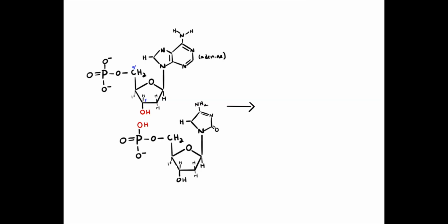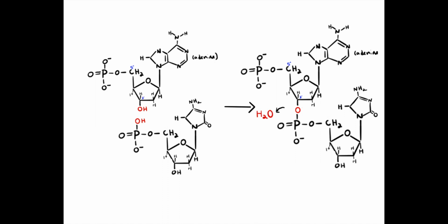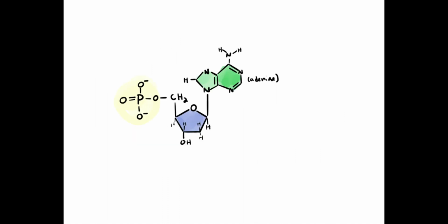So this is just regular DNA synthesis, 5' to 3'. Looking at a nucleotide such as adenosine, you can see that on the second carbon, there's no OH group, and that's just what makes the DNA different from RNA, because RNA usually has an OH group there. In Sanger sequencing, not only is there an absence of the OH group on the 2' carbon, there is an absence of the OH group on the 3' carbon. So it goes from deoxy-ATP to dideoxy-ATP. And that's just going to prevent DNA synthesis from continuing because there's no 3' OH to keep adding nucleotides to.